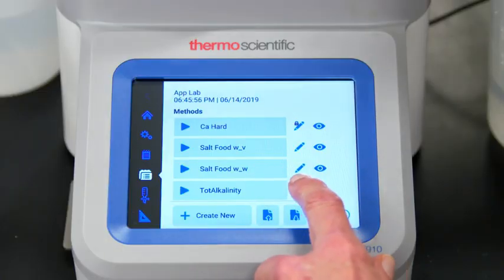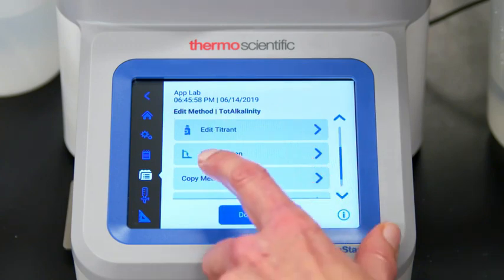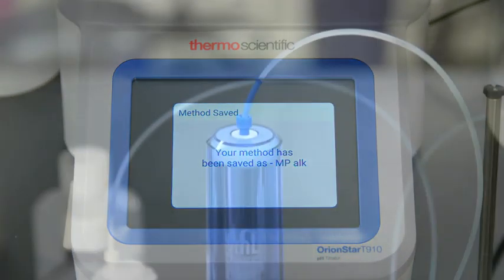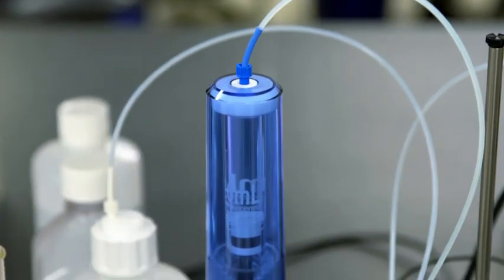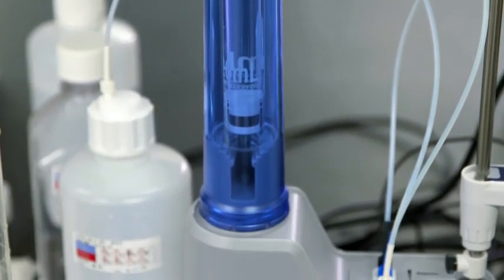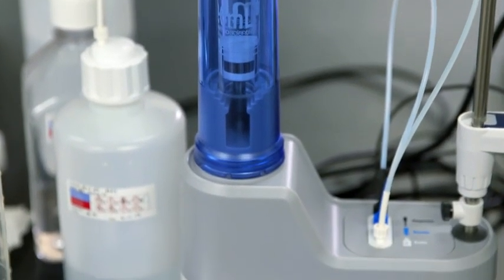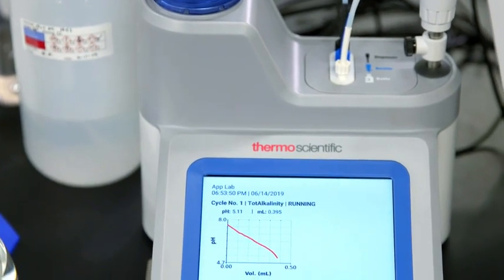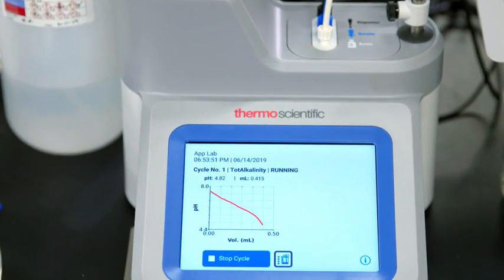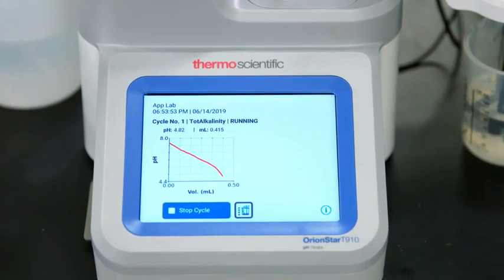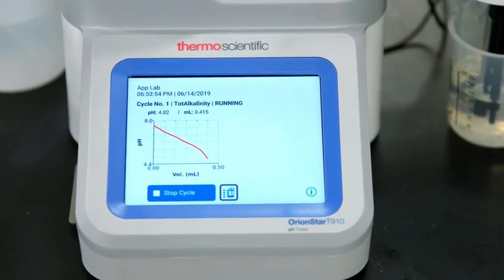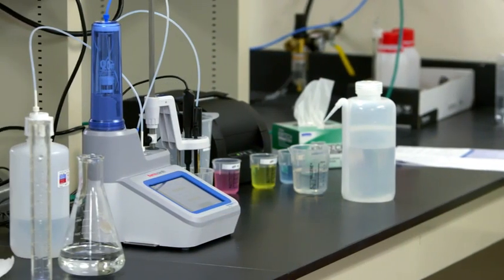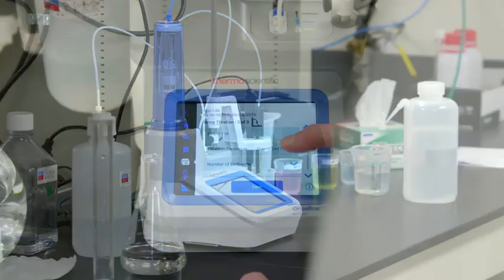We'll be using a pre-programmed method to determine total alkalinity, or m-alkalinity, in a water sample. This method is a direct titration to a preset endpoint at pH 4.5 using acidic titrant. The method may be edited to perform M&P alkalinity, or total alkalinity with other titrants, or in other samples as well.